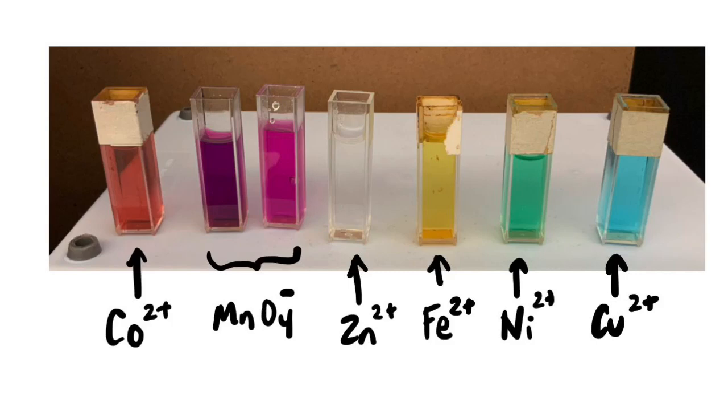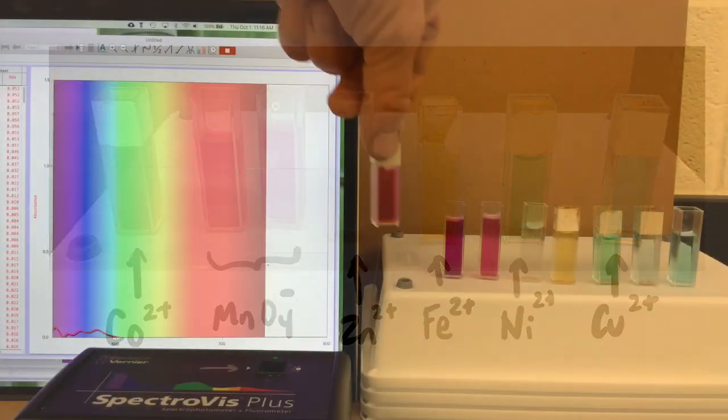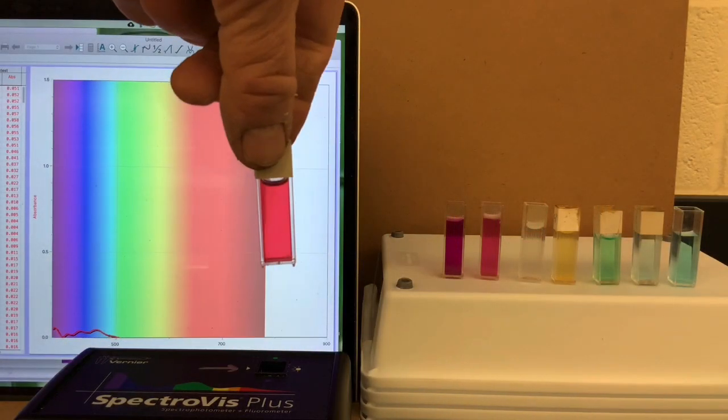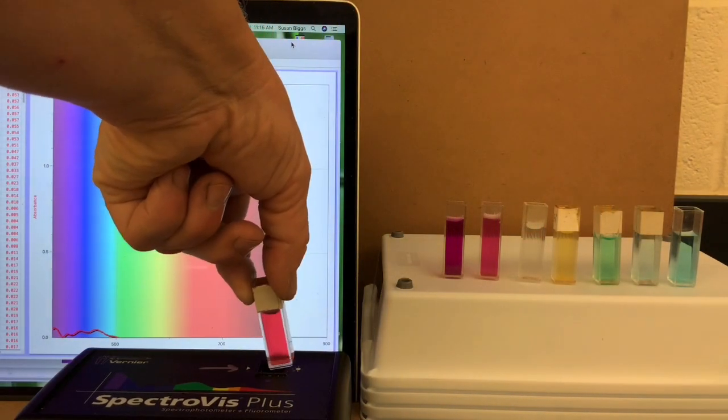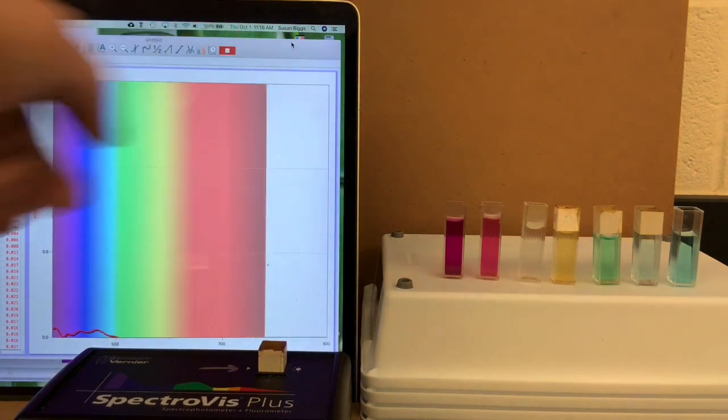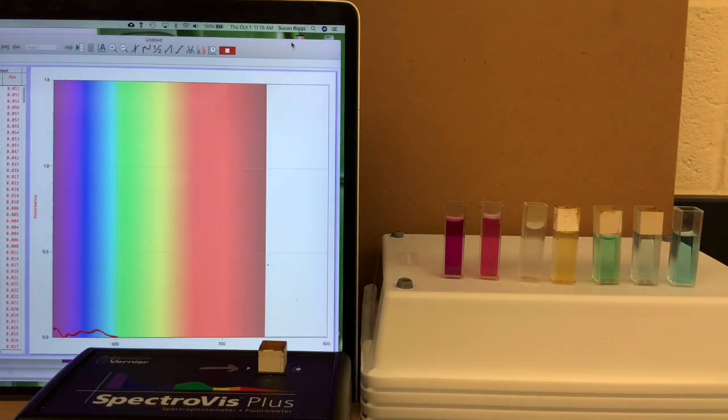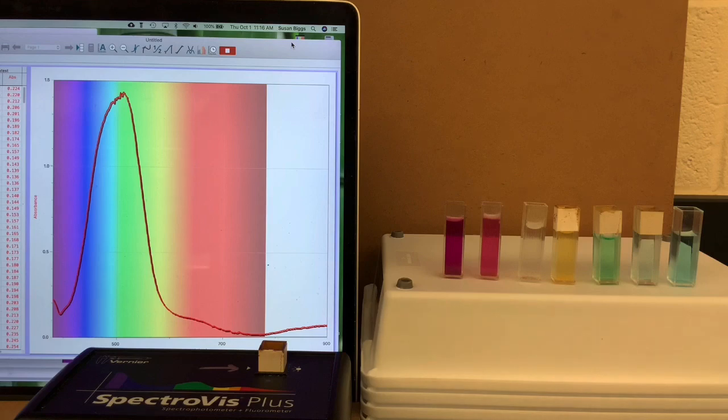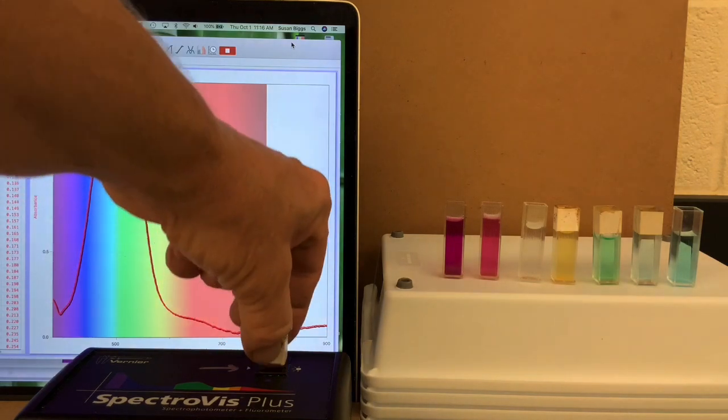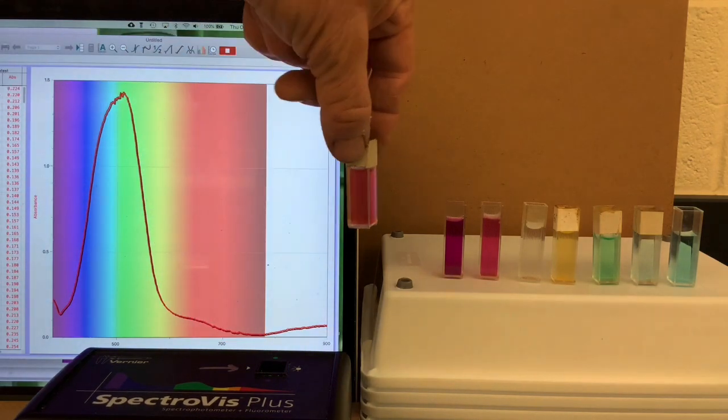We'll take a close look at these six solutions, considering their color, red for cobalt, and paying attention to the color of the light that is absorbed, as shown by the graph.